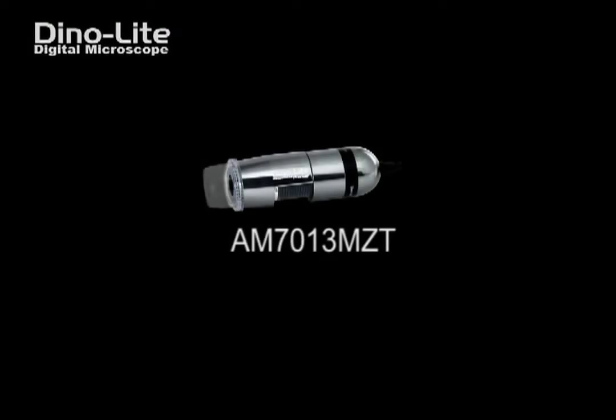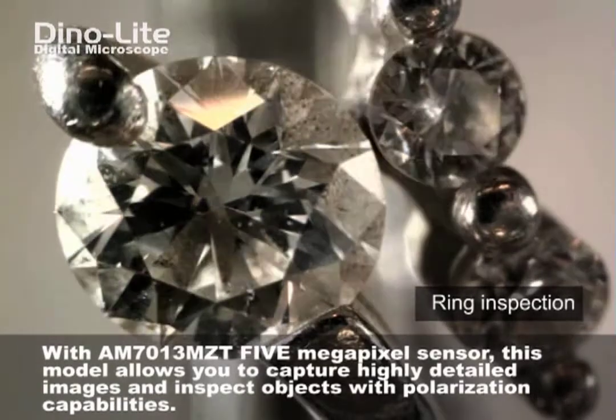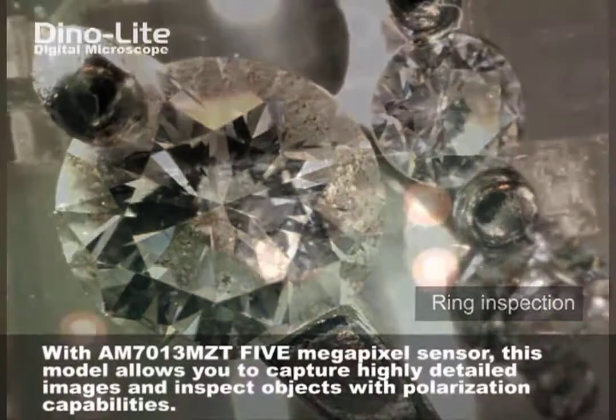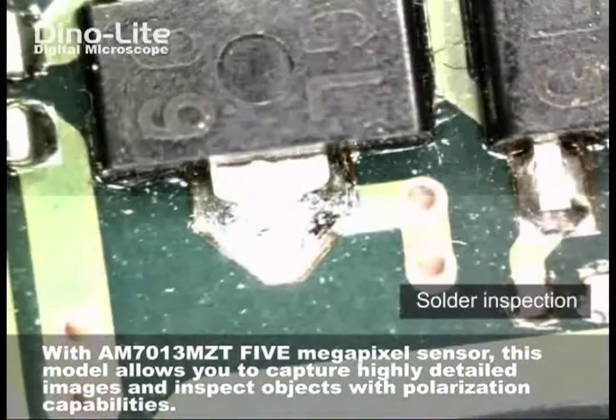Featured in this video is the 5-megapixel AM7013MZT. This model comes equipped with analog polarization capabilities, effectively reducing glare and harsh light spots when observing and capturing highly detailed images of your object.